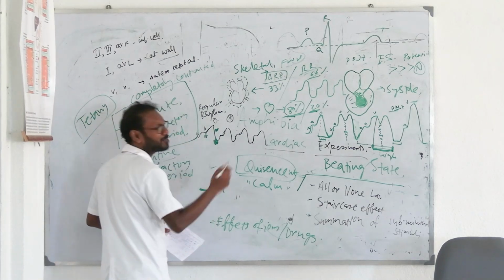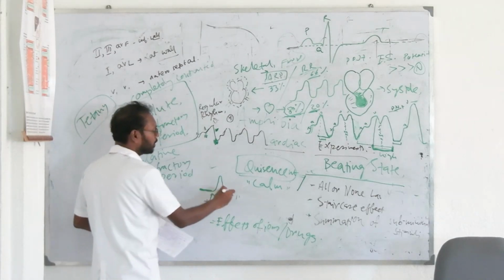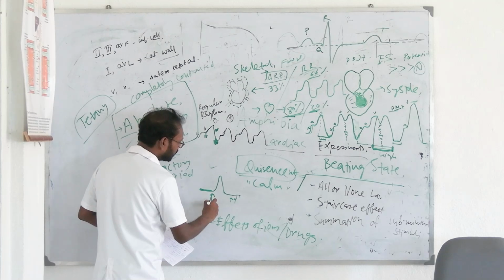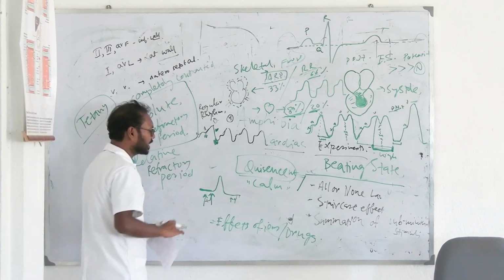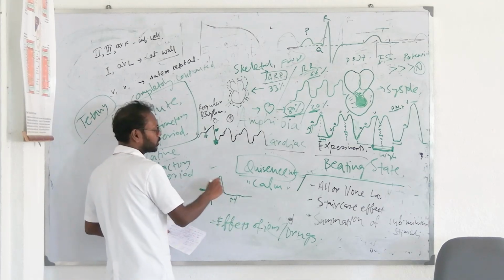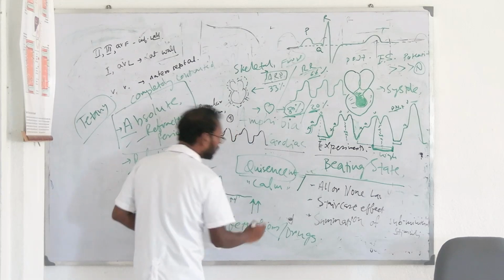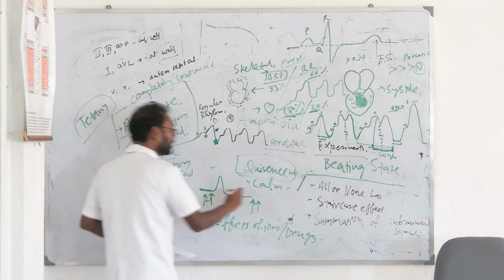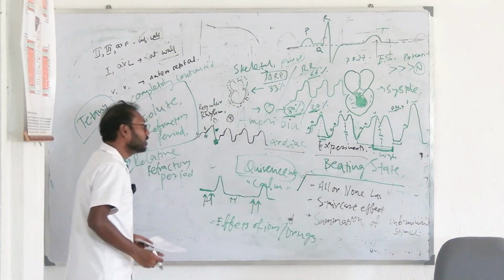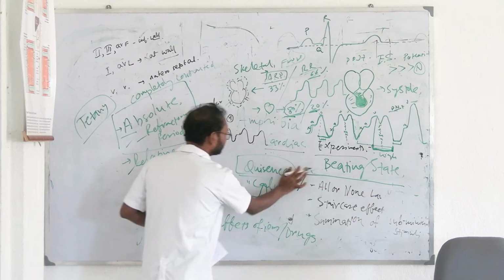Now again we will provide a stimulus, but now this is sub-threshold. Sub-threshold means this was the threshold, but this test energy is very low. This is the threshold energy. This action potential is very small, so there will be no beating, no starting of heartbeats or contractility. Then again we will provide more force, or threshold force, and again it will create a beat like this. Now we will be increasing the stimulus more and more.